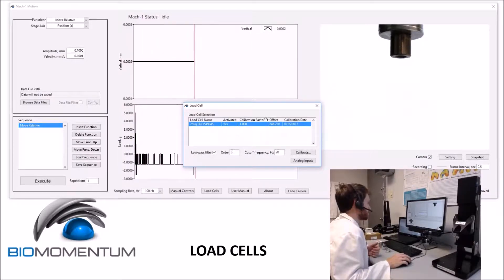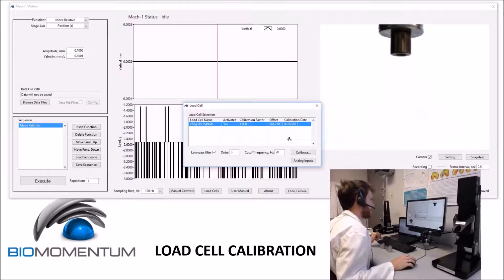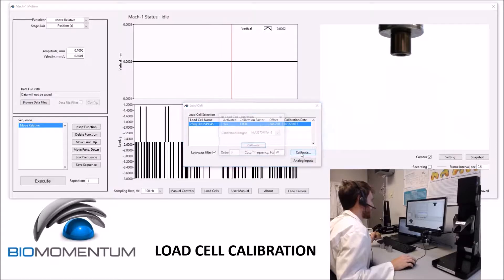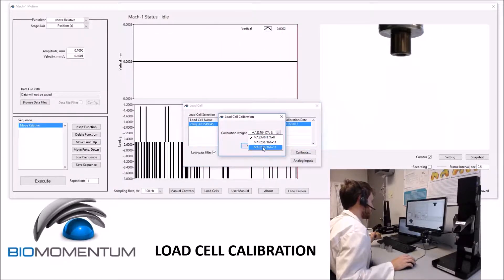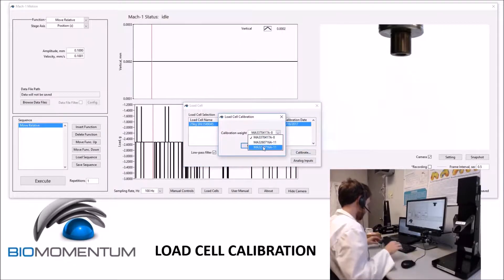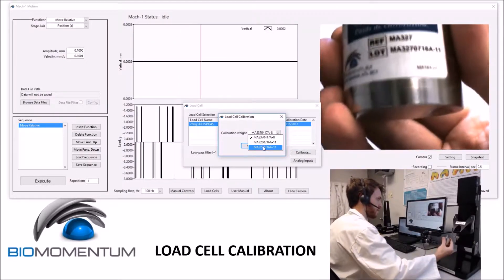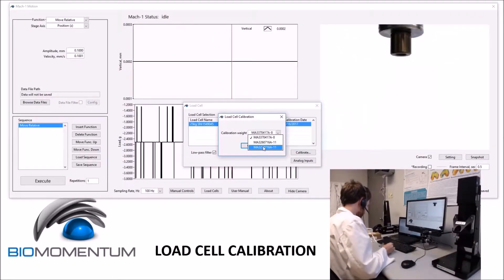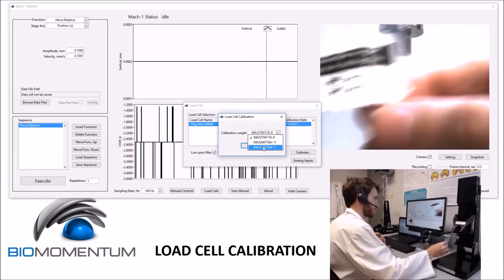The other three columns are produced automatically after a calibration procedure. To calibrate a load cell, click the calibrate button. This will open a new window where a calibration weight can be selected from a drop-down list. The names of these calibration weights are usually written on the weight themselves or in the bag that the weight came in.